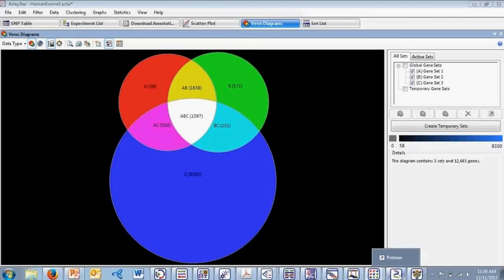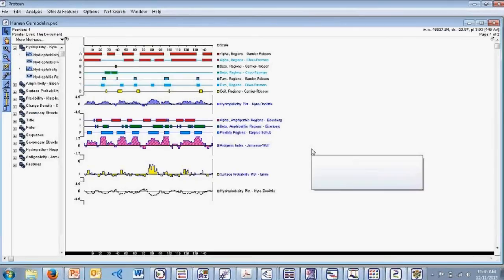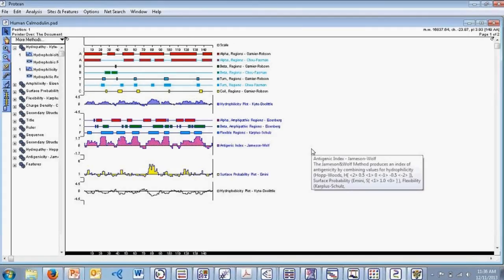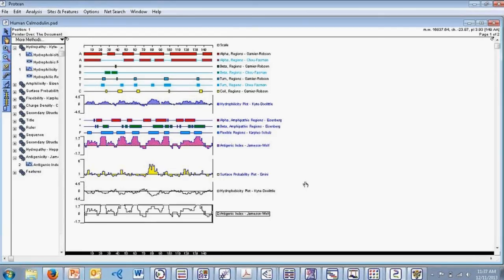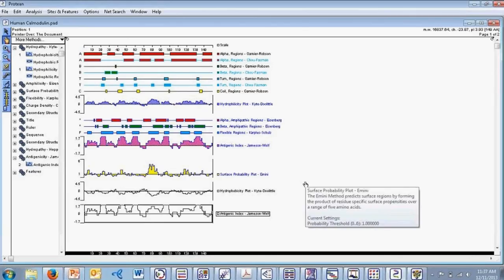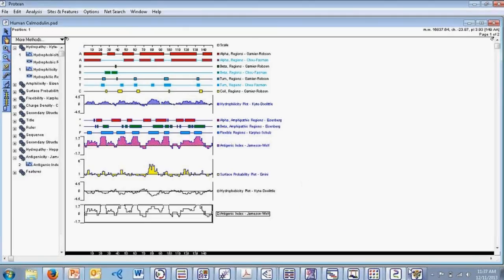The first application is our Protein application, which looks pretty similar to GeneQuest. This application provides you with tools to locate antigenic determinants, predict protease digestion patterns, and analyze secondary structural characteristics as well as different physiochemical properties of protein sequences. Right now we're looking at a human calmodulin sequence. Like GeneQuest, there are various method options on the left-hand side that you can drag out onto the interface to look at those particular methods.